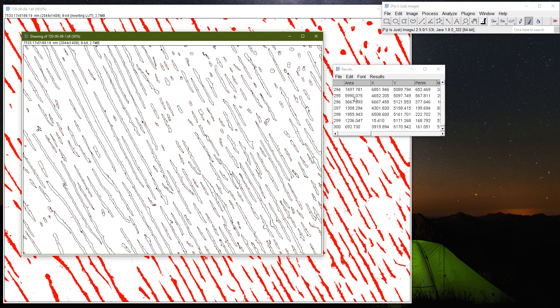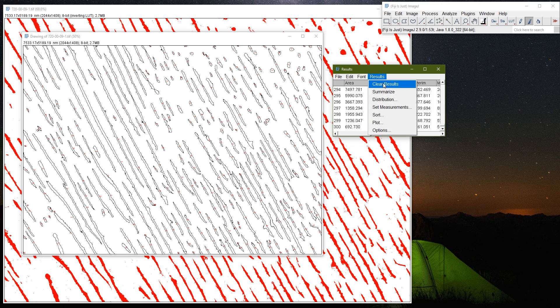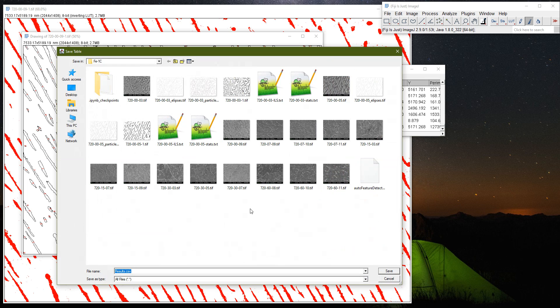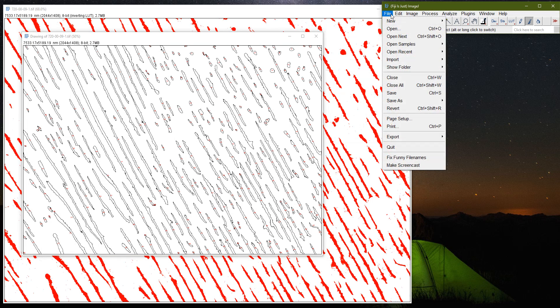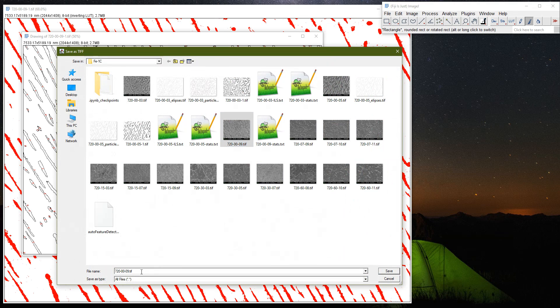I have all my results in this window with area, XY, perimeter, major, minor axis, and other parameters. I will show how to fine-tune which parameters you want to measure. I will also click Summarize so all results are summarized at the bottom of the file. Then I will save the results file — Save As — and name it 'particles'.